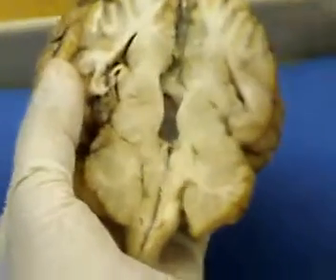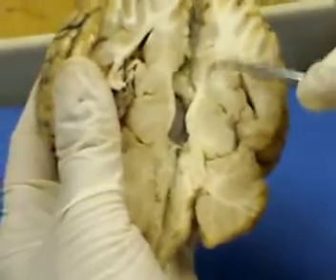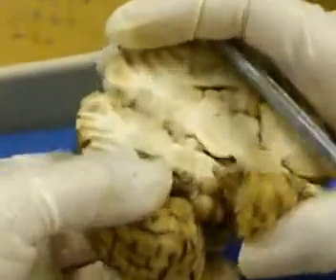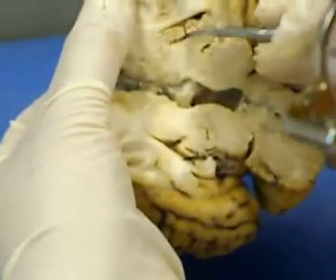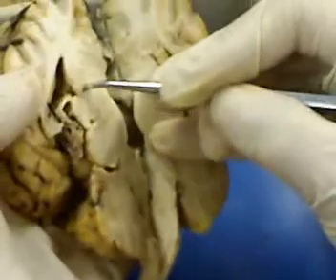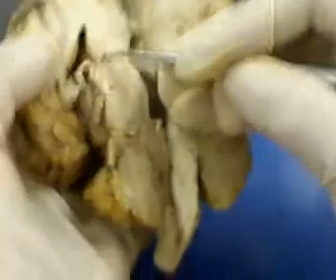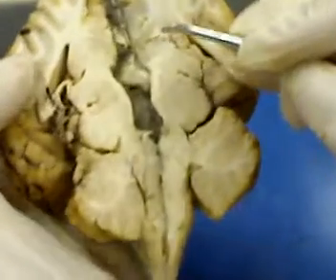Where is the other one? Lateral ventricles and somehow this. Okay. It should have been somewhere here, and this cut has not been good. Is that the third you're looking for? Yeah, she's looking for the third ventricle. There's two more, third and fourth. Where's the third? Hypothalamus is there. Here. So it's tucked away somewhere. Yeah, it should be here, but my cut has not been very good.